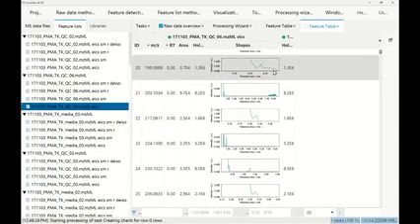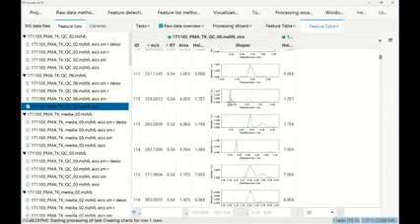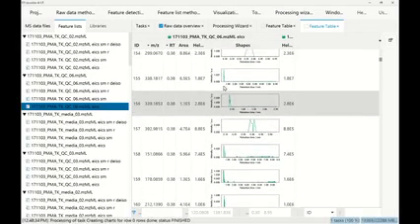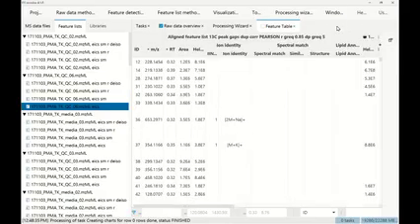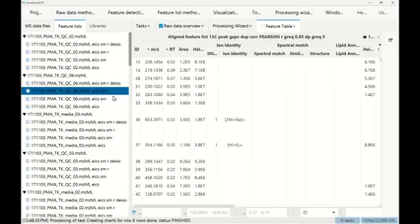You can see here on the side, if I open the EICs, I'm going to see all the different extracted ion chromatograms, and there might be, of course, multiple features, multiple peaks in one chromatogram that we then split into separate features. There was a smoothing step that we then did. Then we did a resolving step, so we split features in a chromatogram into separate rows in a table. And then we also applied some de-isotoping.